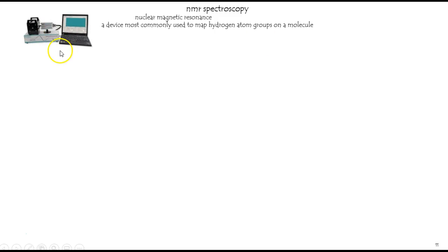There's a typical device. They've gotten much smaller and much cheaper, and this is perhaps the smallest one I've ever seen. I pulled this off of Amazon. It costs about $6,000, and anybody in this field knows that that's just insane when you compare it to what they used to cost and how big they were.